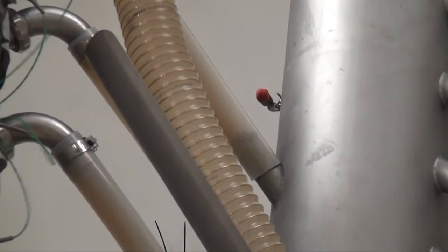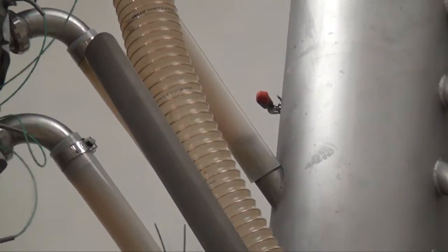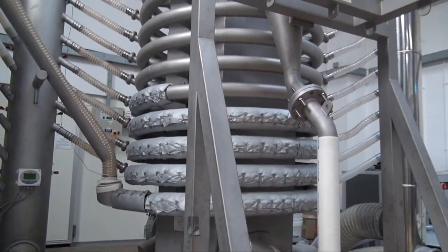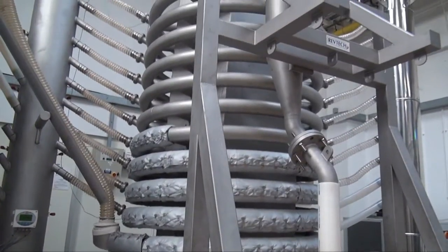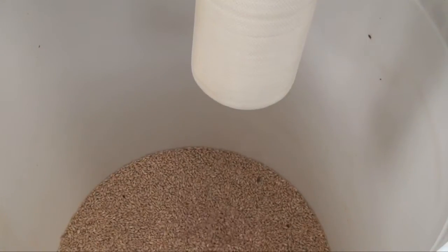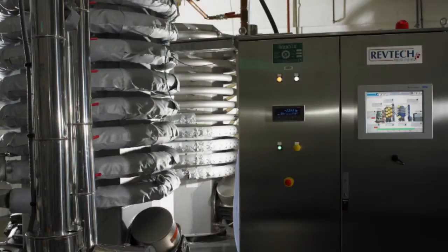The pasteurization spiral can also be used to roast or toast products, such as nuts and seeds, a process which doesn't require steam addition. The pilot facility shown is available for independent trials to help companies establish the process parameters for their products.